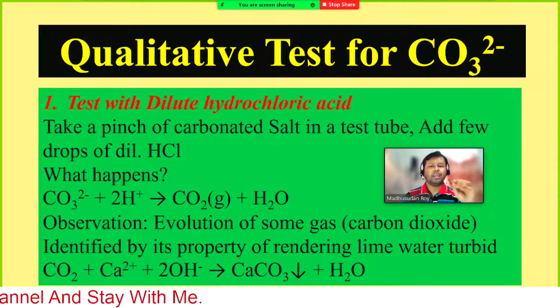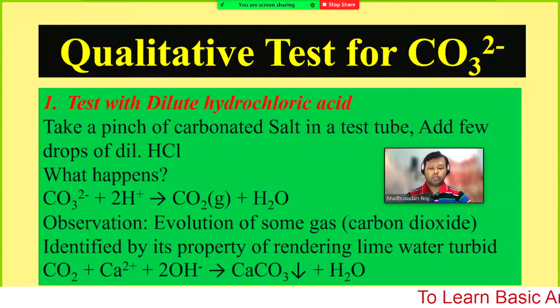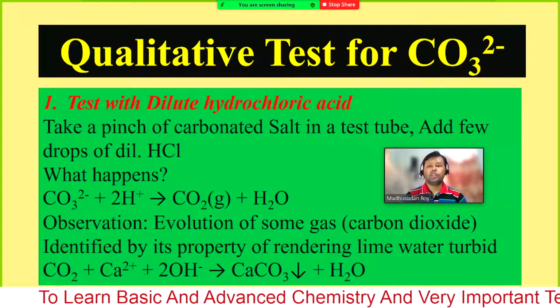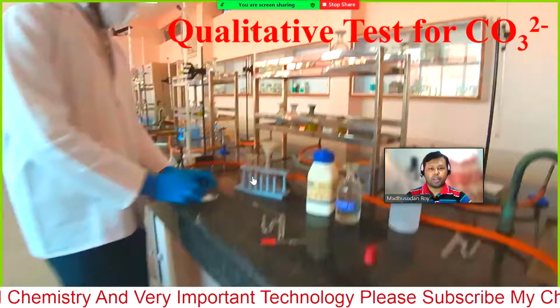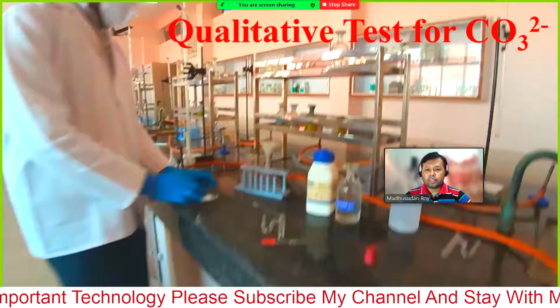Today I will show you a good video that they have made on YouTube. It is a little bit complicated, however it is very good. If we can provide these types of cells, that will be very good for you. So let's see the video, and how we can pass the carbon dioxide gas and how we will observe.